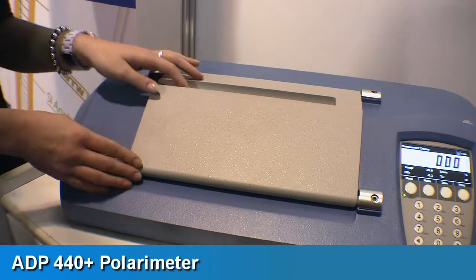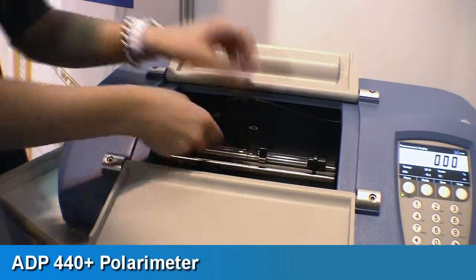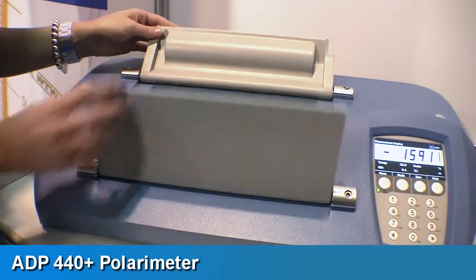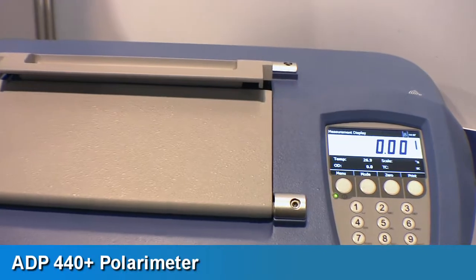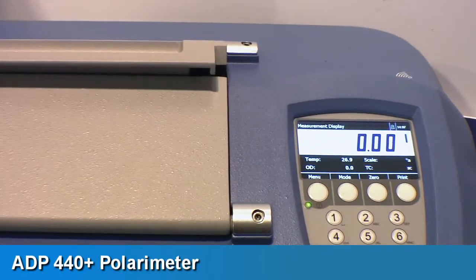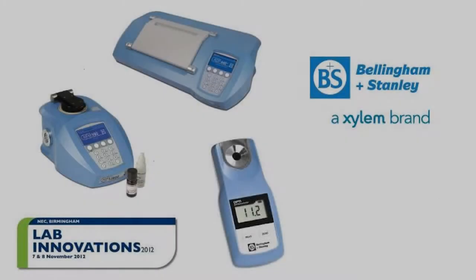The ADP440PLUS is used primarily in the pharmaceutical industry where pharmacopoeia compliance is required, and also for various other lab applications. It is simple to use and, as it is a continually reading instrument, the operator is only required to place a sample tube in the chamber and read the result.